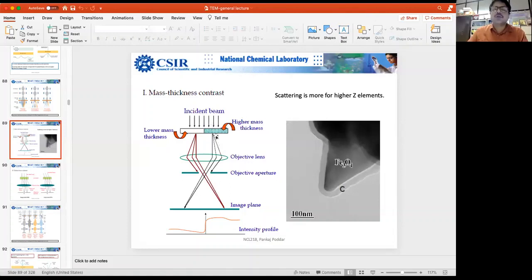But you already mentioned that. Some of them will be generating X-rays, so they will deviate actually. Finally, when you count, that means this area, which is thicker, will be darker. And here probably, let's say out of 1,000, 100 electrons, or maybe 90, or maybe 50 will be absorbed, and the rest will be transmitted. So this area will be looking lighter.